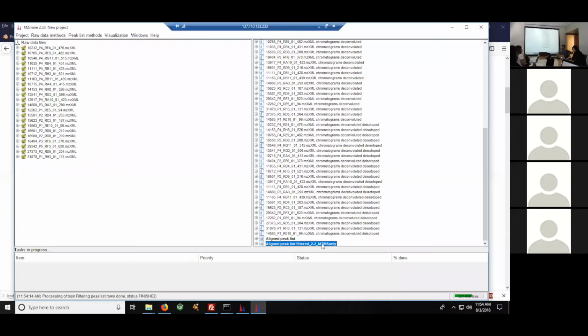It basically tells you that a feature consists of multiple features which belong to different isotopes. This is retained. Yes, this is retained. It did not throw them out. It grouped them together. It's called the grouper.